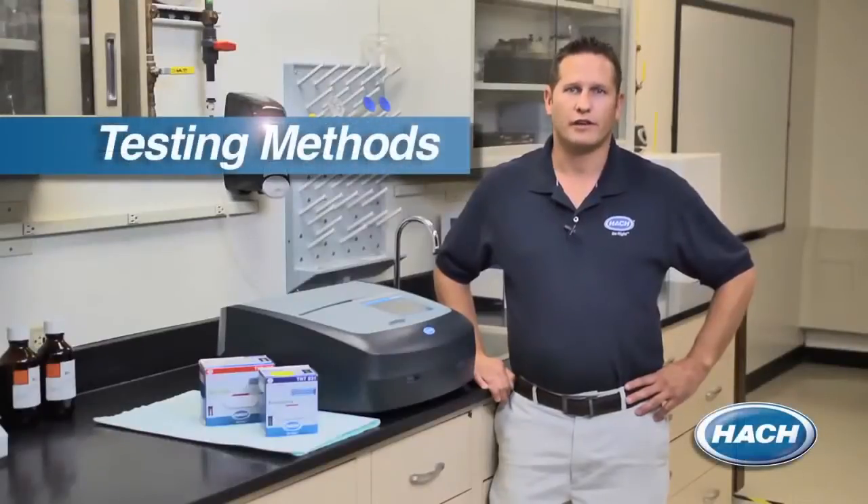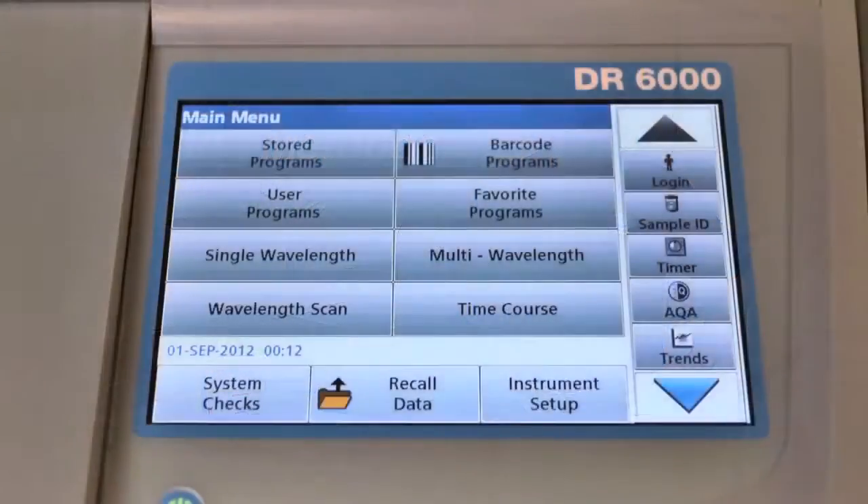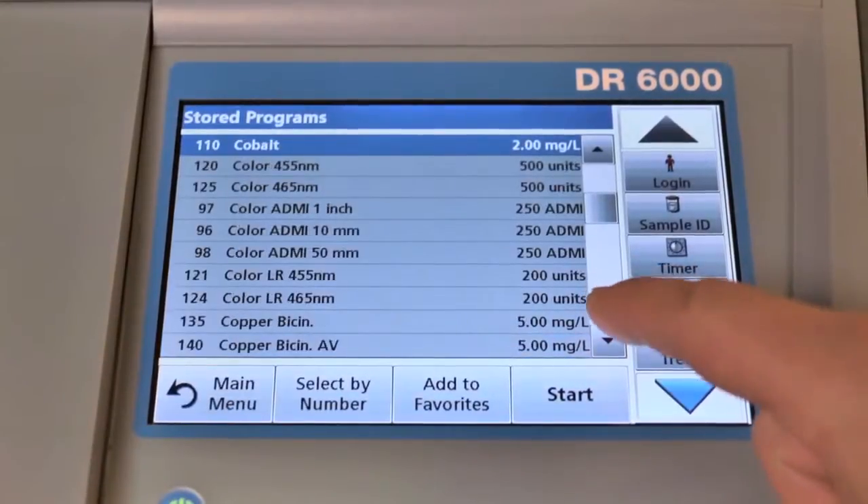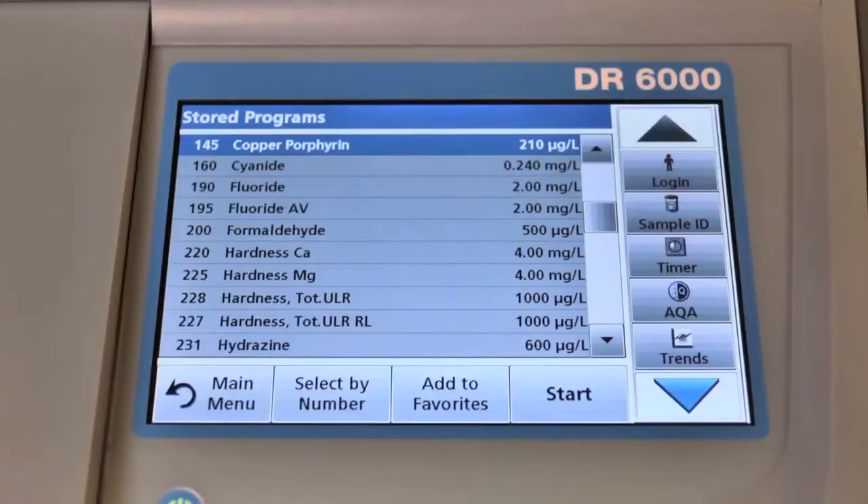And when not using your custom methods, this instrument comes pre-programmed with over 250 testing methods, including standard methods for chlorine, fluoride, phosphate, and nitrate, just to name a few.